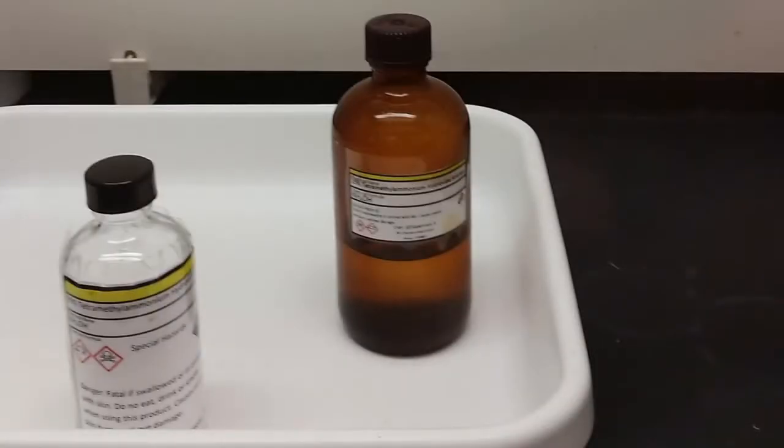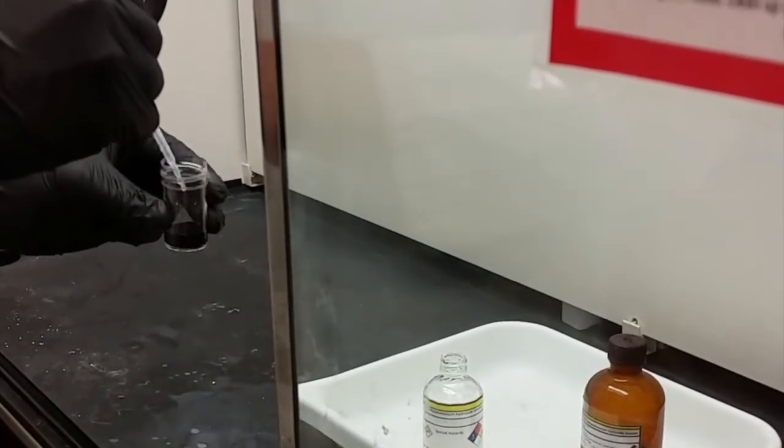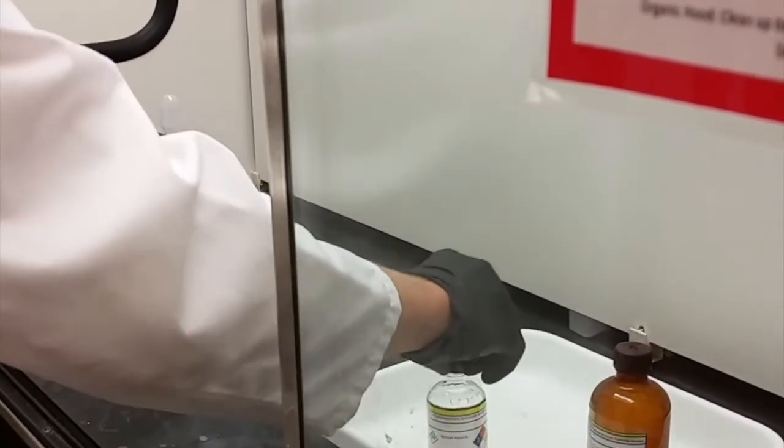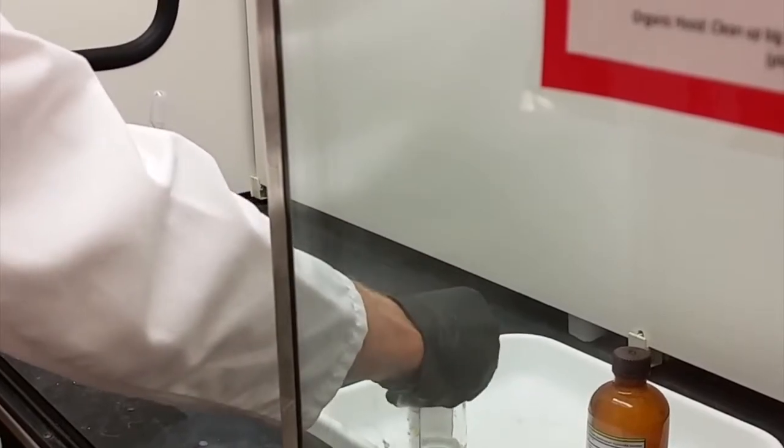The tetramethyl ammonium hydroxide, which acts as the surfactant in this experiment, will be kept in one of the large fume hoods. Be careful when you're handling this chemical and add the one milliliter that's called for directly into your plastic container.